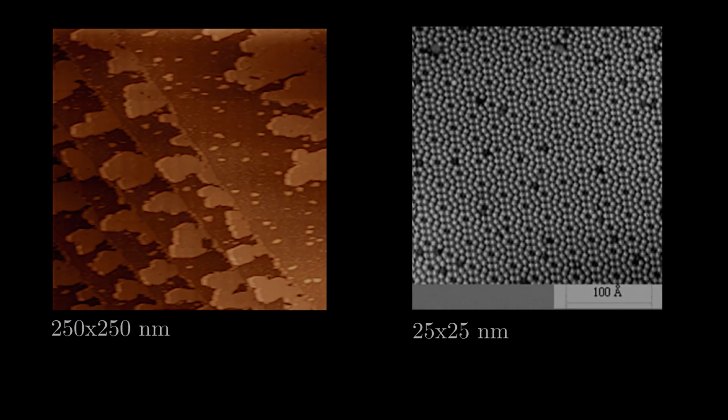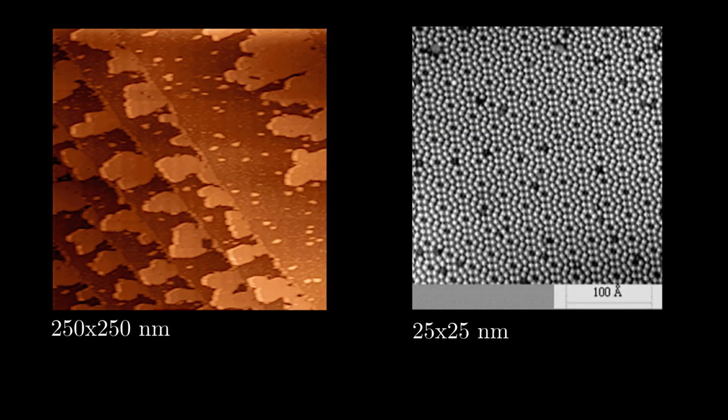The vacuum prevents contamination of the sample. Low temperatures limit the movement of the atoms in the sample due to thermal kinetic energy. Under such conditions, it now becomes possible to distinguish individual atoms. As the tip passes over an atom at constant height, the tunneling current will be slightly higher when it is over the center of the atom due to the slight change in proximity. Through computer analysis, this signal can be extracted.